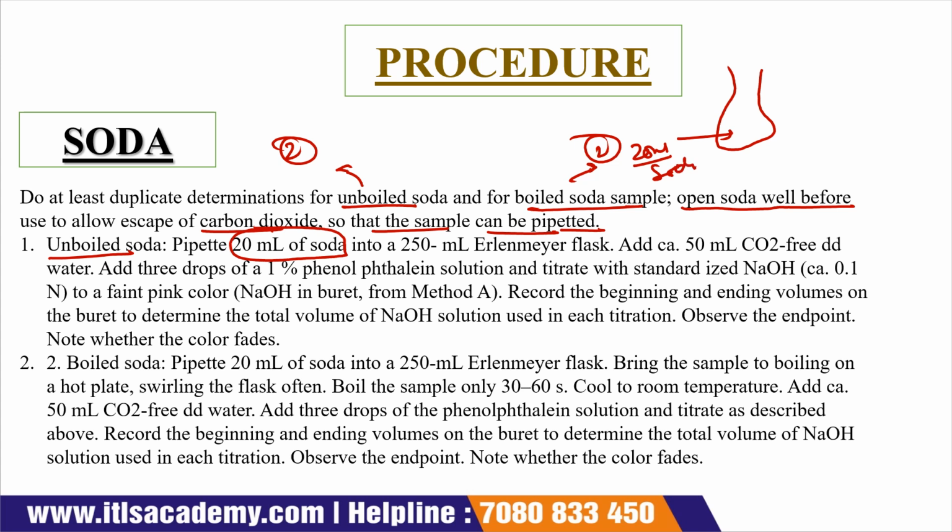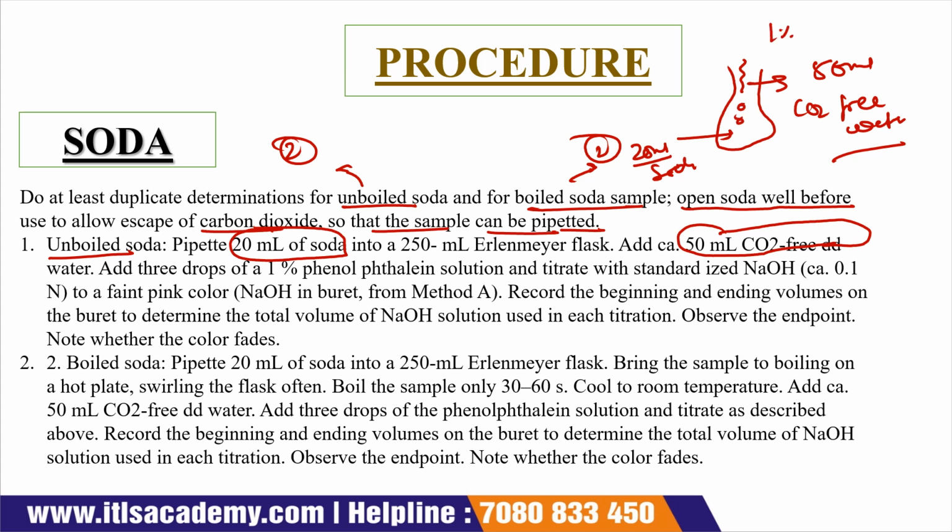After that we add 50 ml of carbon dioxide free deionized distilled water. Then we add drops of 1% phenolphthalein, around 3 drops.